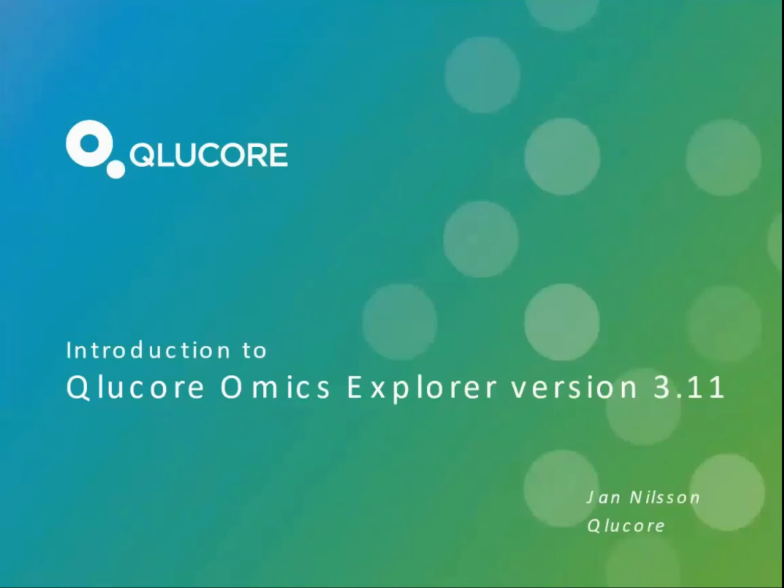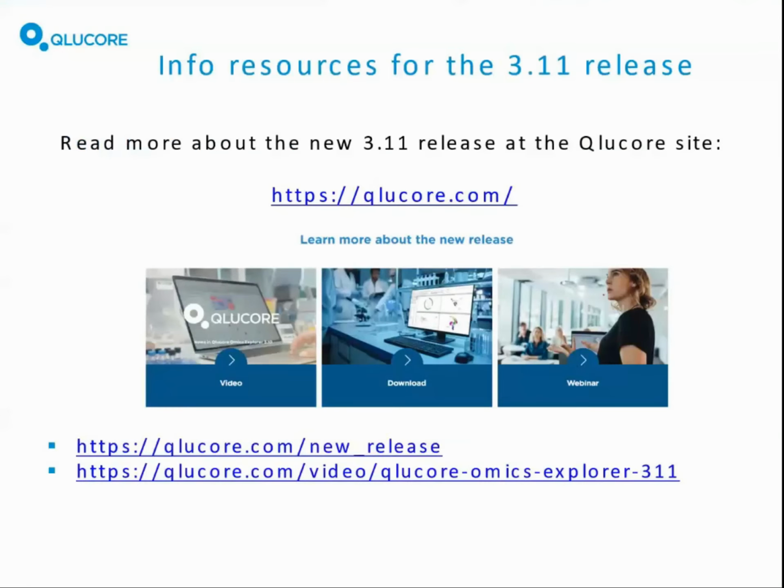We'll start by giving a short introduction to the new version, and I will then make demonstrations using a proteomics dataset, a qPCR dataset, and also an Olink dataset.